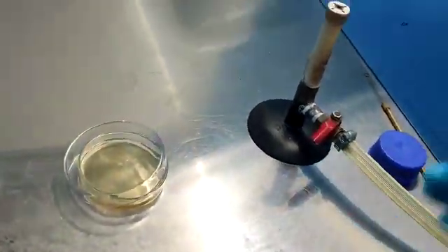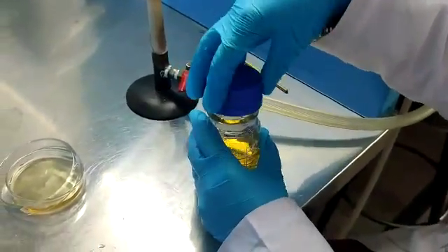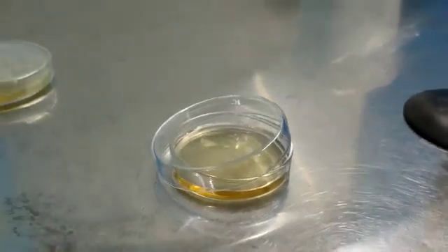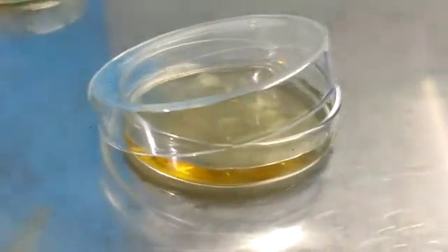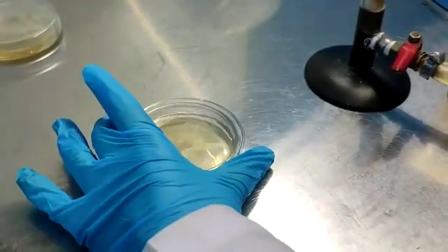Keep the plate for some time so that the media gets solidified, with a small lip open for moisture to evaporate. When the media is solidified, store the plates upside down in the refrigerator.